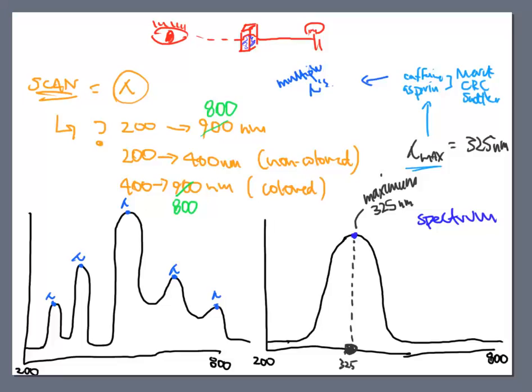But there is one overall lambda max that's still the favorite on the buffet line. And that is the hump that's the tallest. So this is really the lambda max, not the highest wavelength, right? This wavelength would be higher. This is around 790-ish, 795-ish, right? And then if I take a look at this lambda, this is going to come in maybe, who knows, 300, 400, 500, somewhere in there. I'll just estimate it. The lambda max is referring to the tallest peak on the spectrum.